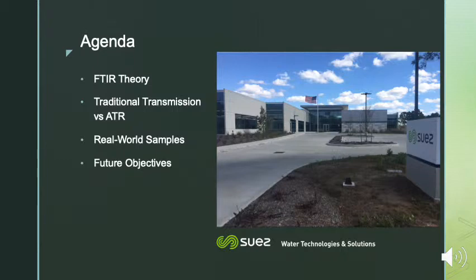My particular role is one of an analyst, providing characterization data for the organic components of samples brought to us by these fouling events. And while my focus is on the organic components, my analyses are not limited to the organic constituents, and in fact, inorganic components can interfere with or influence our organic characterization.